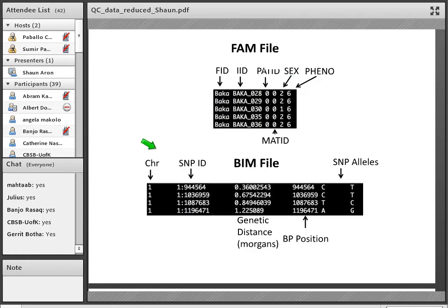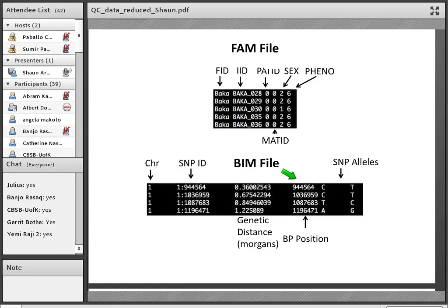In the BIM file, we have information about our SNPs: chromosome number, a SNP ID (which can be an RS ID or chromosome:position format), genetic distance obtained from a recombination map, the base pair position in the genome, and the two alleles for that SNP. For example, a SNP might be either a C or a T. The BIM file contains information about individual SNPs, and the actual genotypes are contained in the BED file, which I'm not showing as it is not human readable. These three files are what we start with when we run our QC.